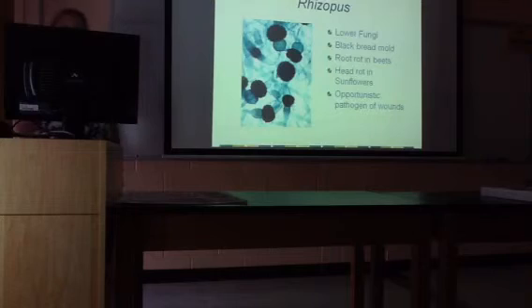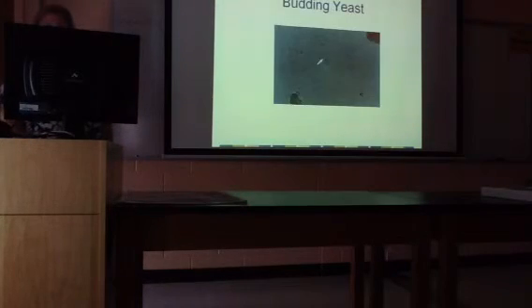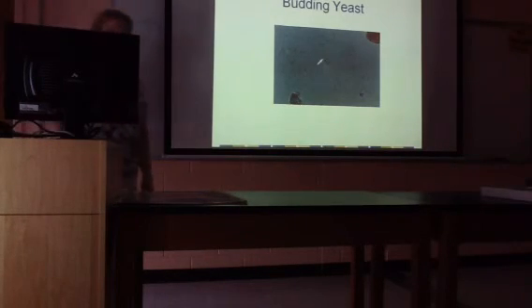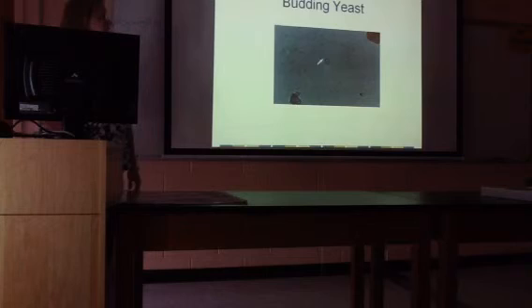Questions on that one? Okay. Moving swiftly along, budding yeast. It's the same slide you looked at in Lab 2, except that Lab 2 called it Saccharomyces. So just looking at that same slide again, doesn't cause any human problems. This is the one for beer and bread and wine.